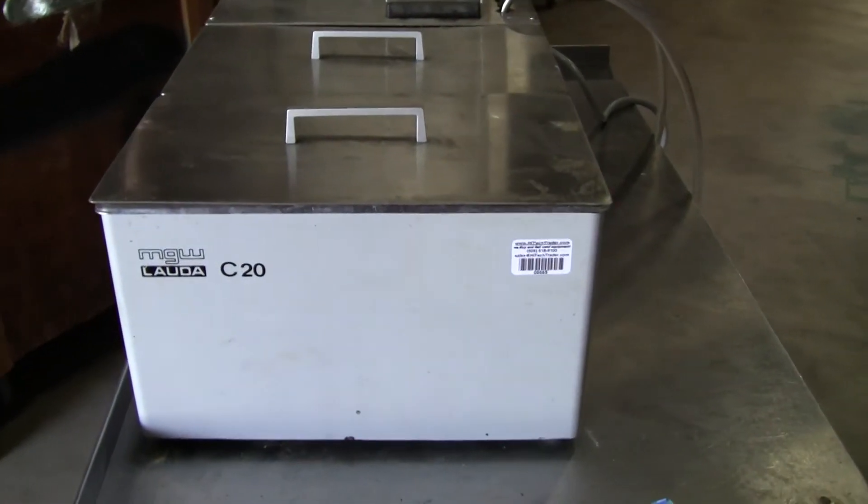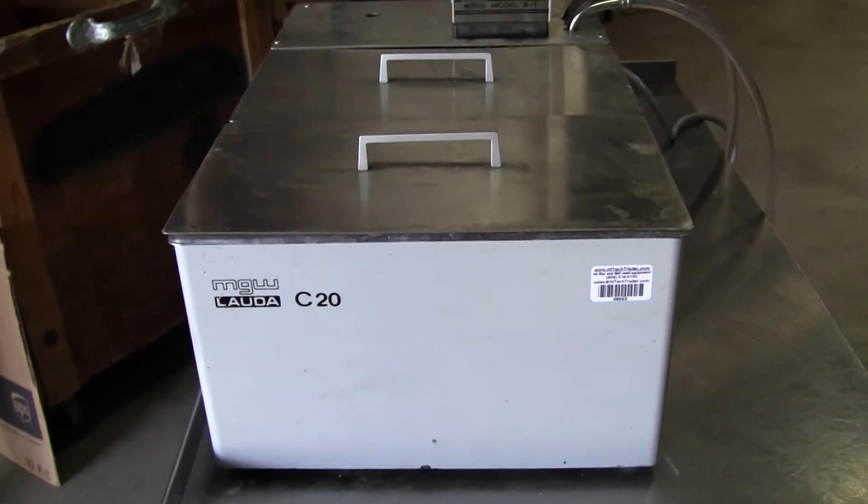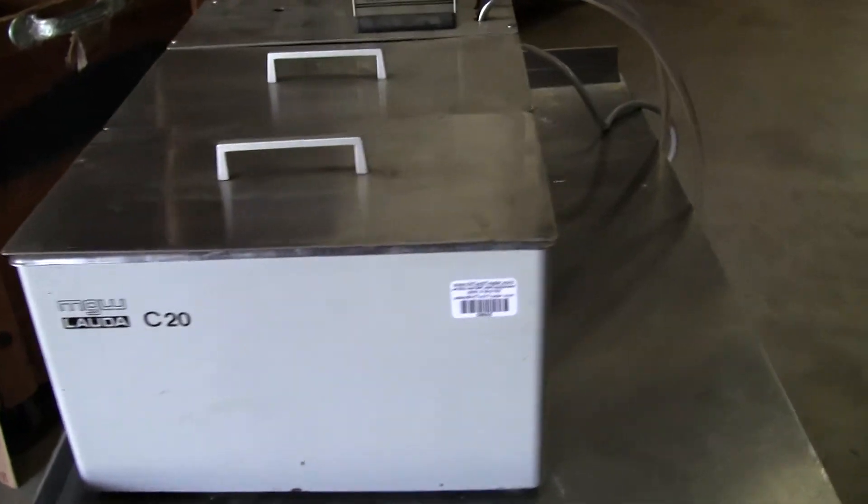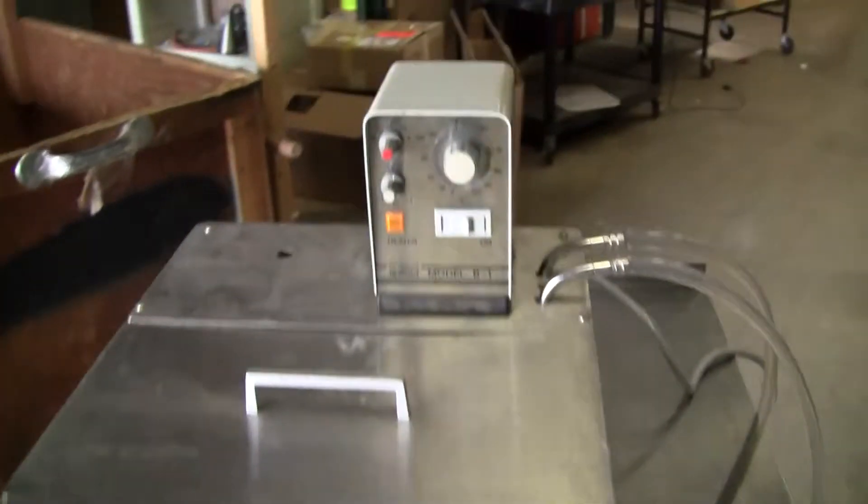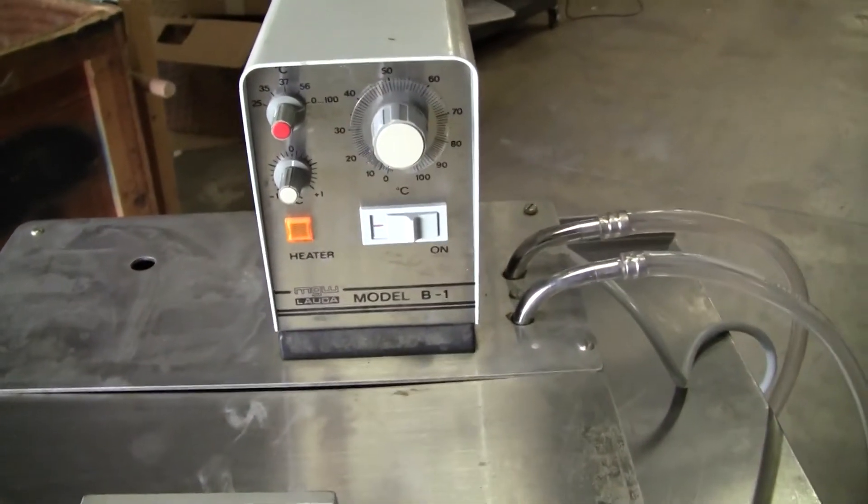Hi, this is Michael Nathau from Hi-Tech Trader. Today we're looking at a classic Lauda C20/B1 recirculating heating bath.